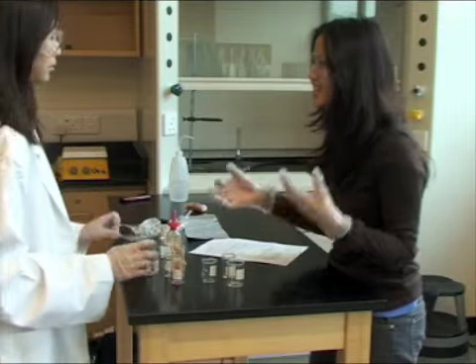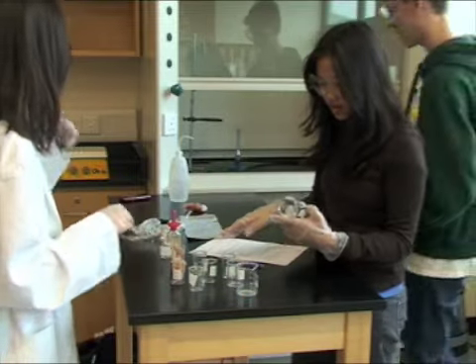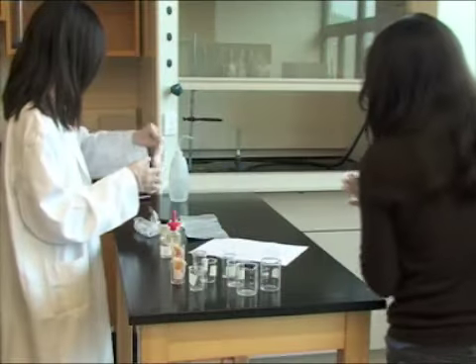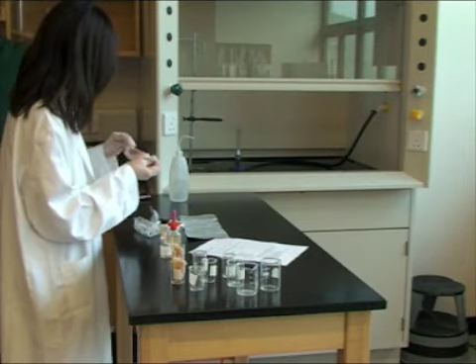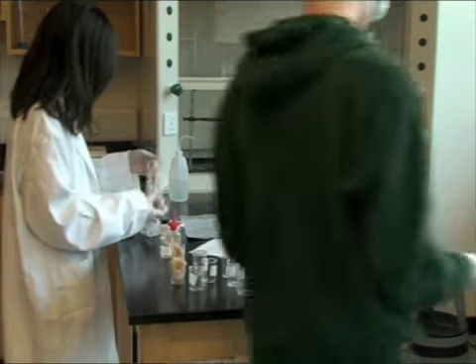The materials we used were 40 milliliters of sulfuric acid, 40 milliliters of distilled water, 2 pieces of pH paper, 1 large piece of aluminum foil, 1 piece of finger-sized fish meat, 1 piece of finger-sized pork, 2 pieces of limestone, CaCO3, 2 beakers, and 8 clear glasses, as well as a pair of tweezers.